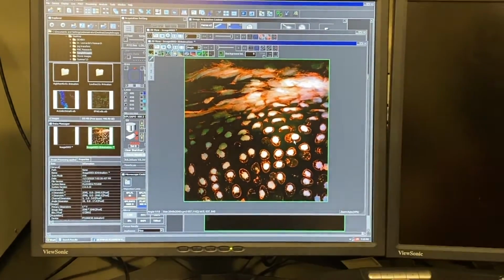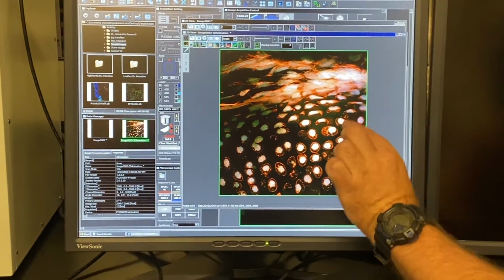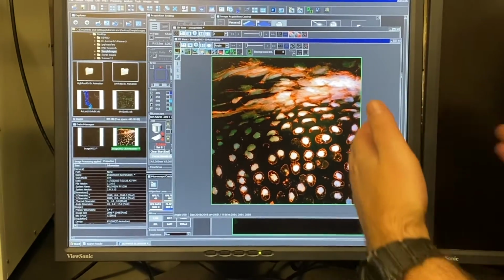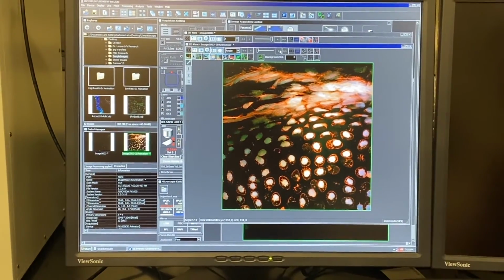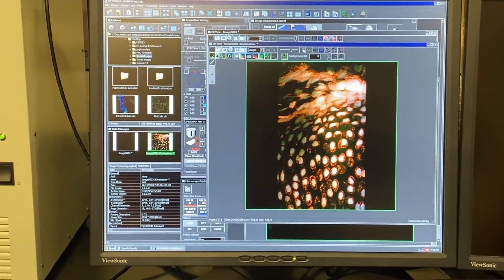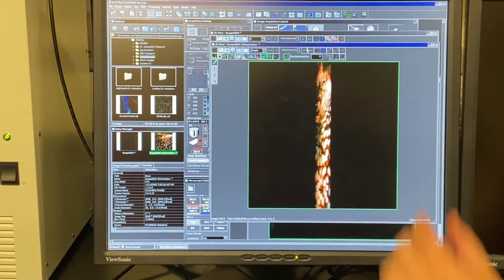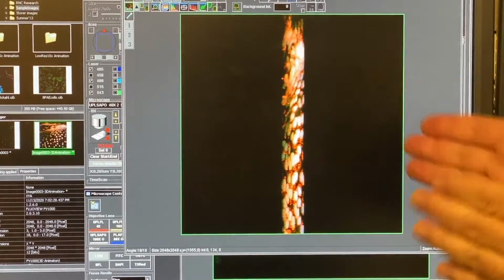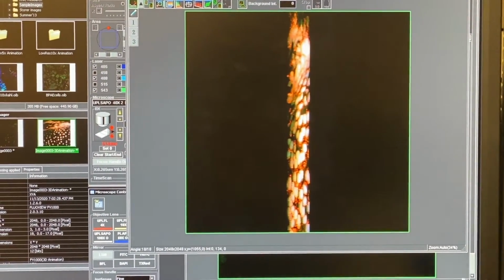We're going to turn this on its side, and you can look and see which cells are more to the left and the right after we've turned it. So let's turn. Here are our 9 optical sections of this one piece of 20 micron thick section.